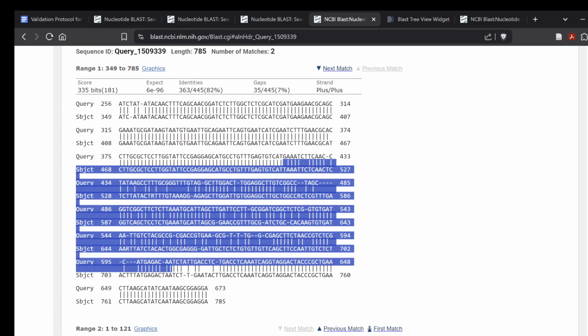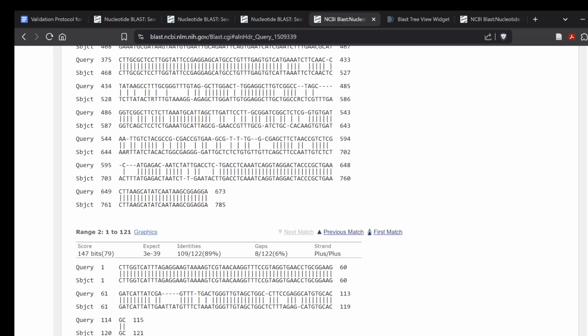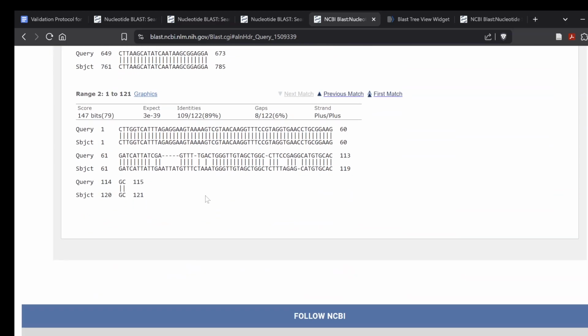They barely aligned. They align better than I was expecting for these 2 genera. And then here's the large subunit, beginning of the large subunit. This up here is the end of the small subunit. Also where the primers are. Here's our primer. CTG, GG, CATA, blah, blah, blah. Okay, cool. Well, that's it.